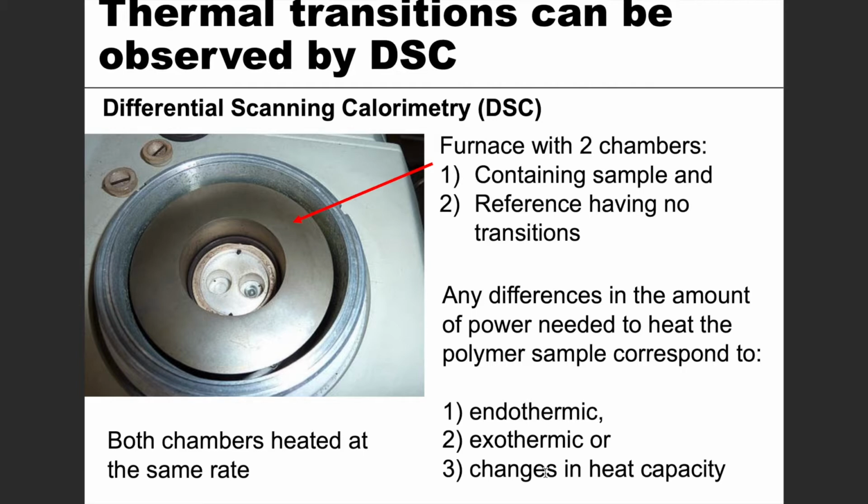We have two independent furnaces, but we heat them up in the same way so that any differences are caused by the sample itself, and we can use that to identify specific thermal transitions and get a lot of useful information about it.